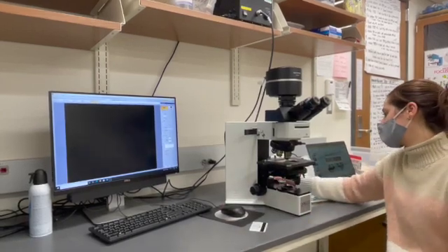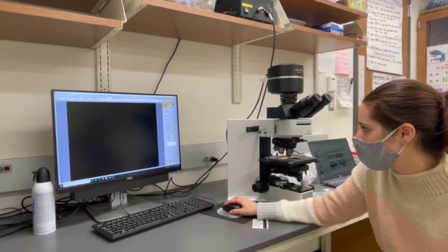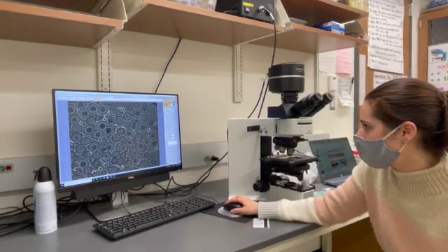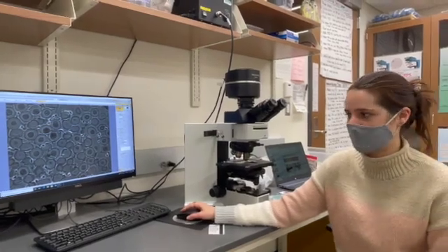We're going to want to turn down the light a bit, and then turn up our exposure time to see our phase image. And there you go — you can see all the cells with the little halo around them.